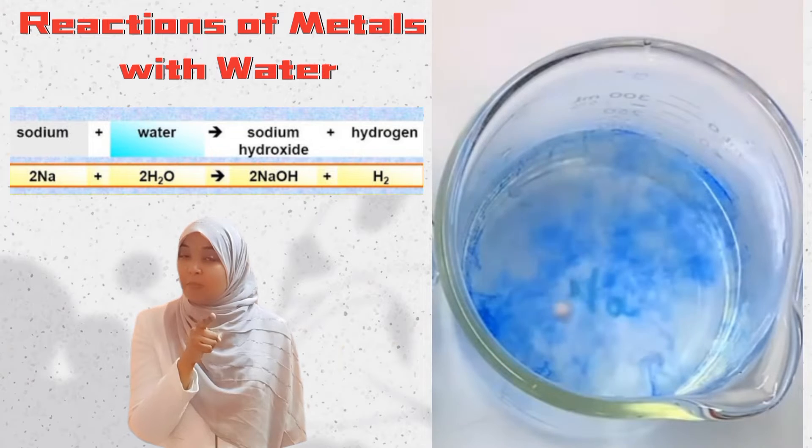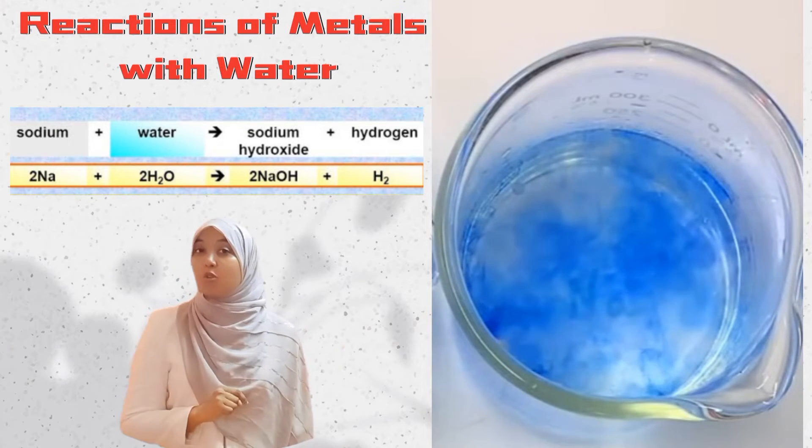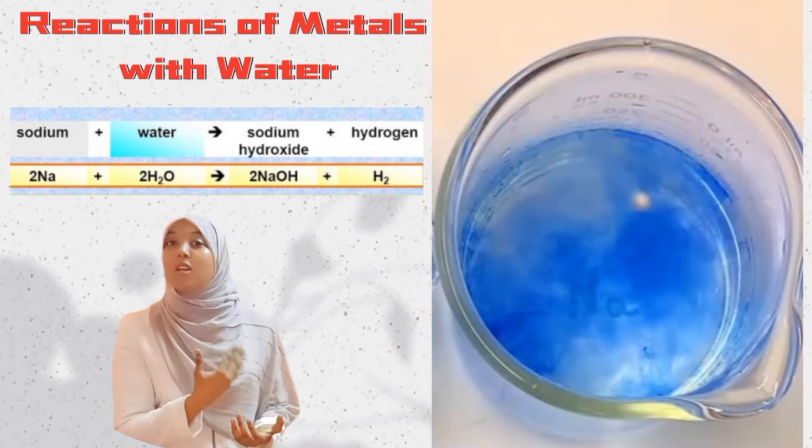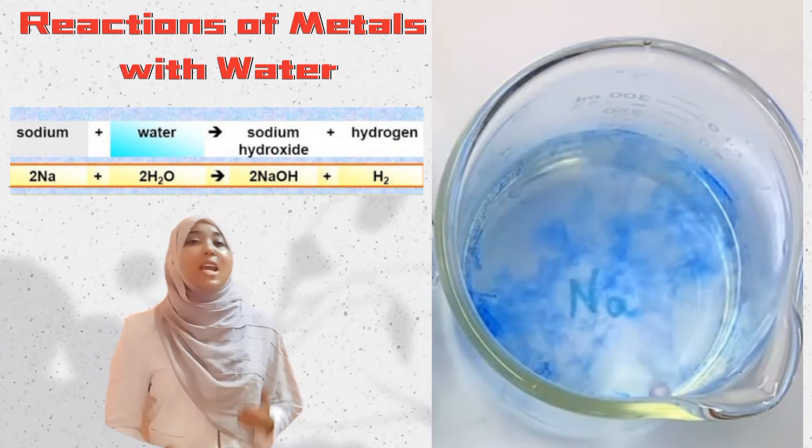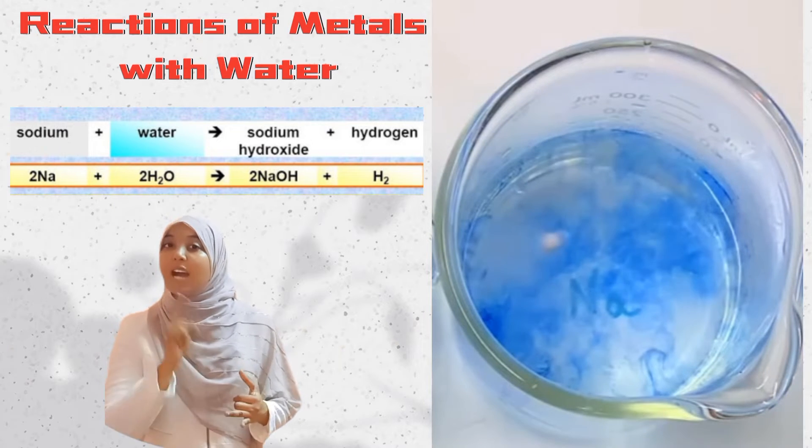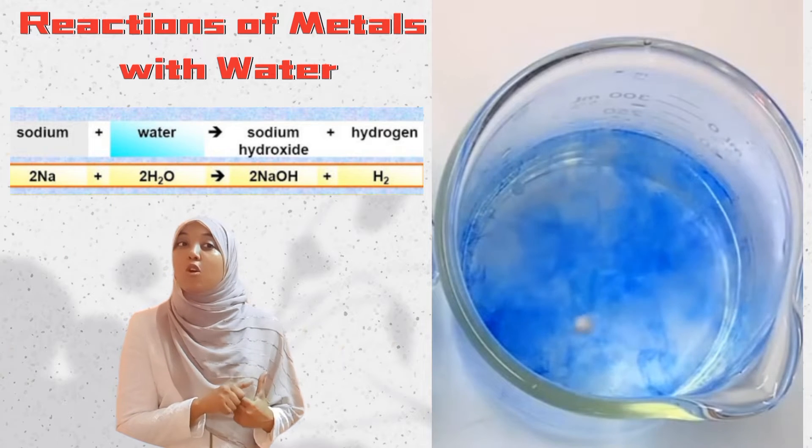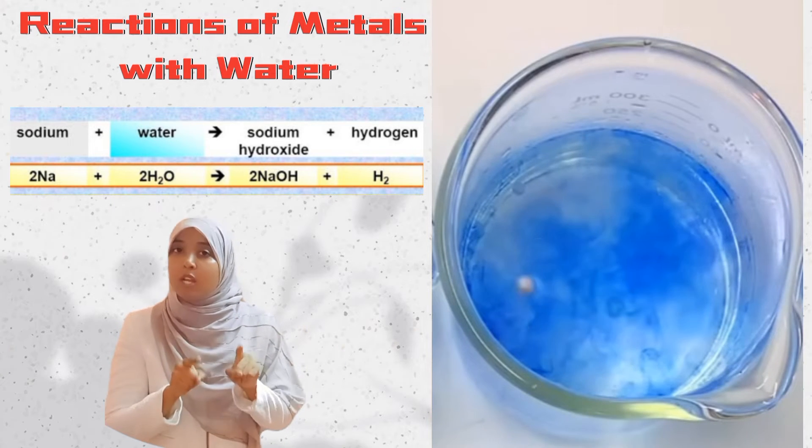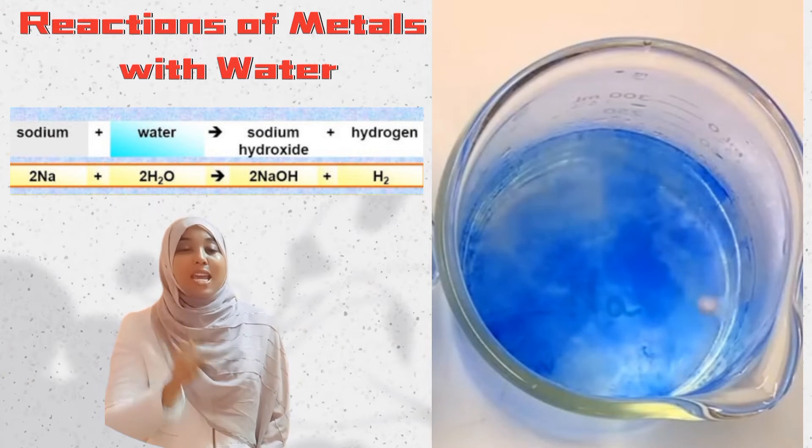Did you hear that? The reason for that fizzing sound is hydrogen gas being produced. These metals react with water to form a hydroxide plus hydrogen gas. In the case of sodium, we have sodium hydroxide and hydrogen gas. The reason the solution is turning blue is because of the indicator. It shows that the solution formed—sodium hydroxide—is basic.